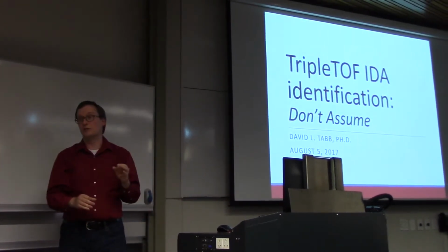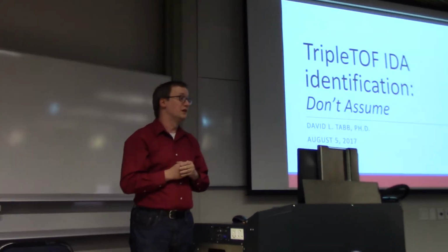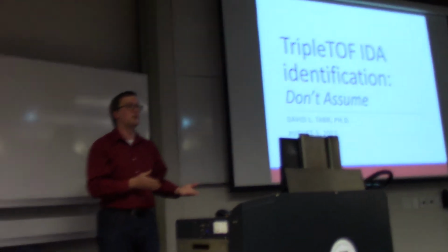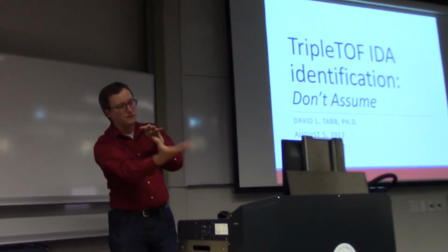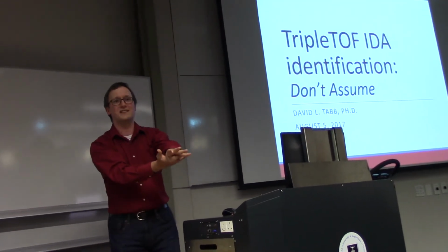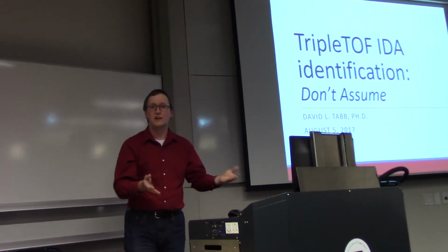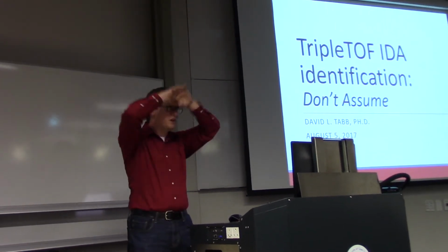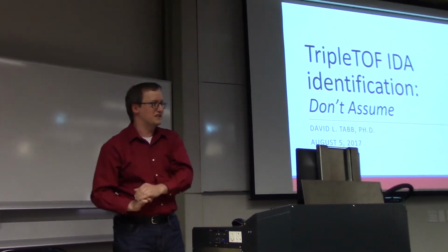This has been the keystone of how the folks over at Waters have dealt with MS to the E data volumes for forever. They have a very long history in this, and there are in fact some open source tool sets out there for attempting to deconvolve these signals and to recognize these fragments from this swath belong together because they arrive at the same retention time and they fall away at the same retention time. And you can do the same in the low energy scans, the MS scans alongside that. So that same approach is still available to us here if we want to decide de novo, with no sense at all of what peptide sequences are present, which fragments belong together in a set.